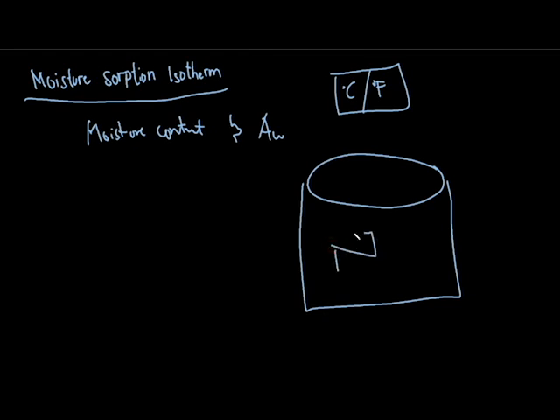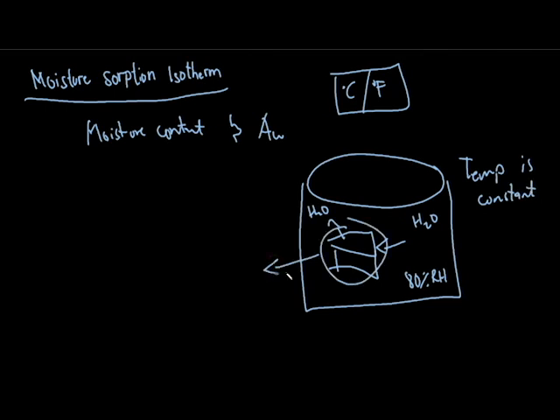So a food product exposed at, for example, 80% relative humidity, based on the characteristics of the food product, will either adsorb or desorb water from its surroundings until such a time that equilibrium is obtained. Take note that, as mentioned earlier, temperature should be held constant. Once equilibrium has been achieved, the food product is weighed to know how much water it has gained or lost during exposure.